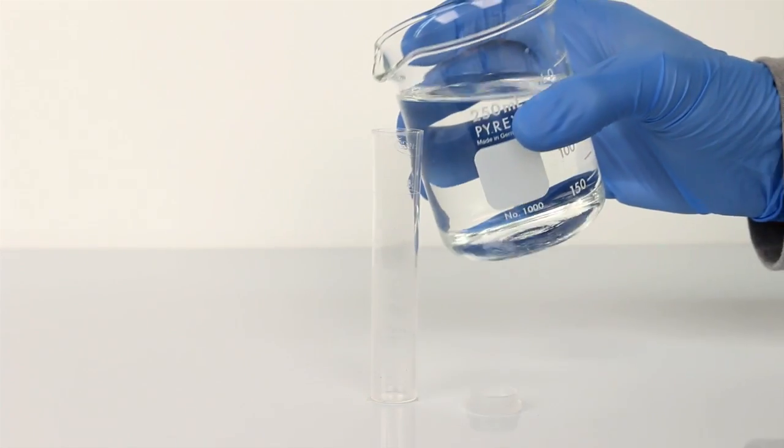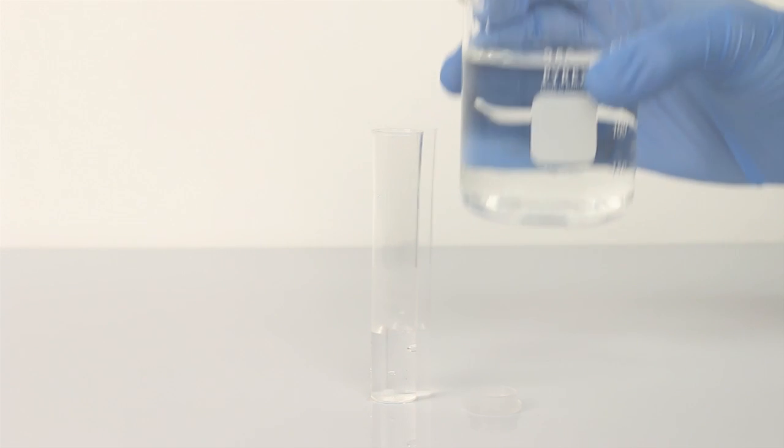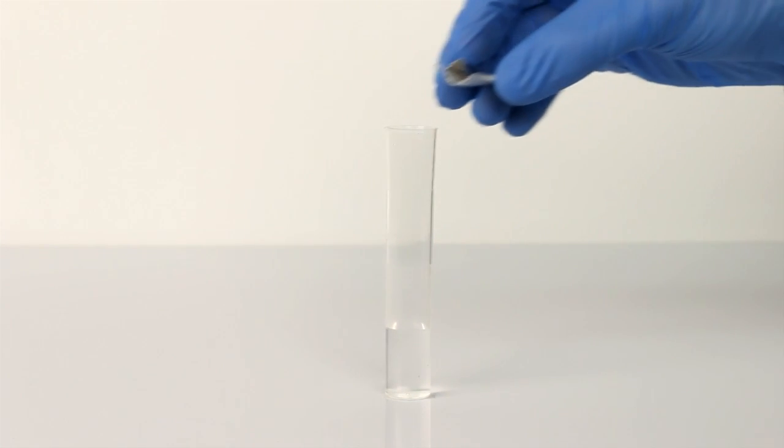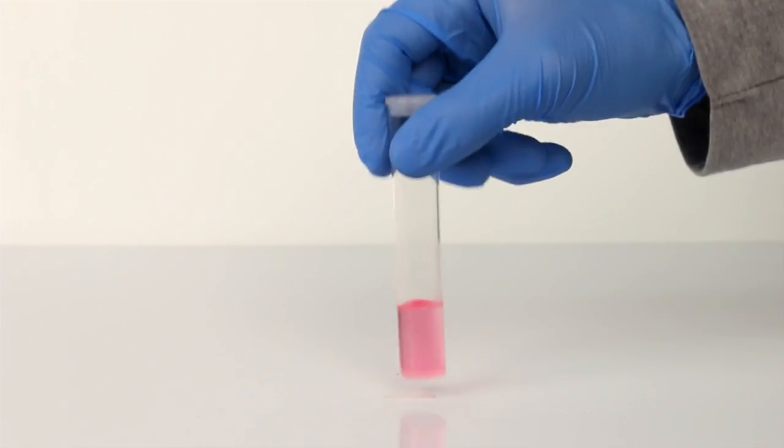Fill the other viewing tube to the 5 ml mark with the sample. Add the contents of a DPD Free Chlorine Reagent Powder Pillow. Swirl to mix.